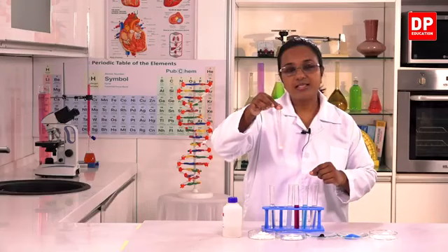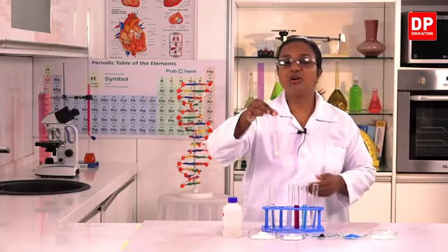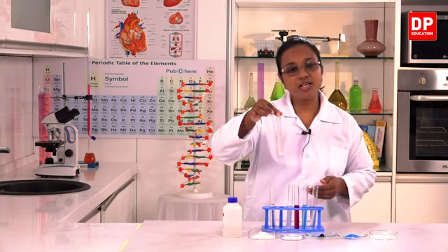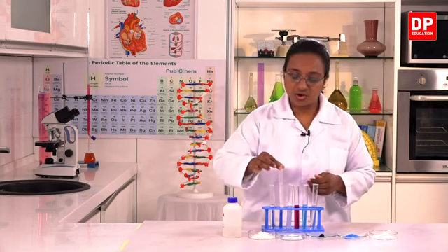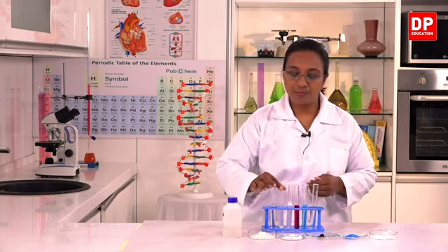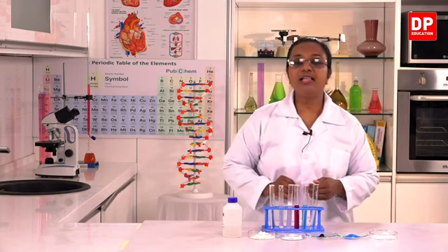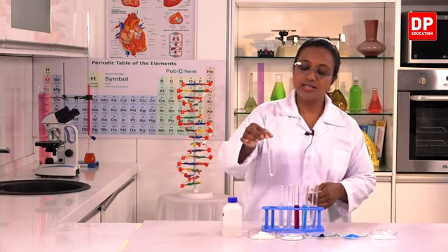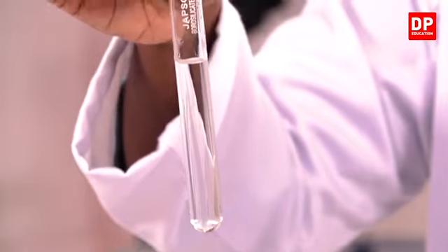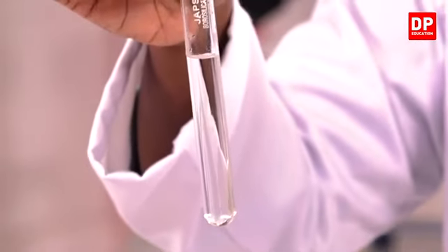So that means here the distribution of the solid is not uniform, and the transparency of the solution is also not uniform. Then we have the ethyl alcohol dissolved in water. That also you can see is a clear, uniform, transparent mixture.